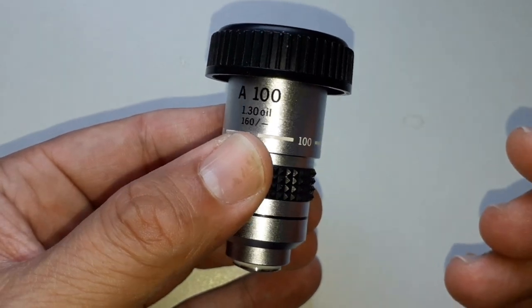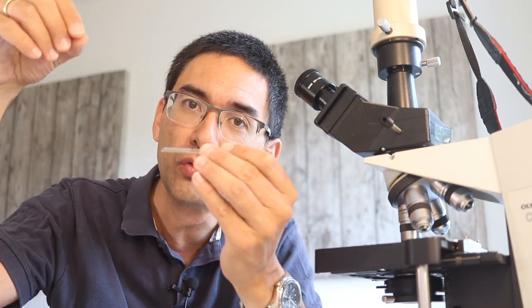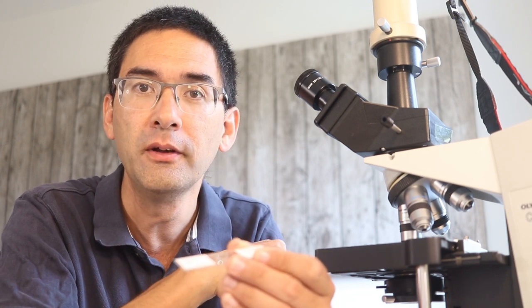If you have a 100x oil immersion objective — you'll know because the word 'oil' is written on it — my advice is: don't use it yet. Wait until you're more experienced. You need immersion oil placed on top of the slide, and the objective is then rotated into the oil so there's no air between the slide and the objective. Many beginners try it and then switch back to a non-oil objective, which then gets covered in oil.